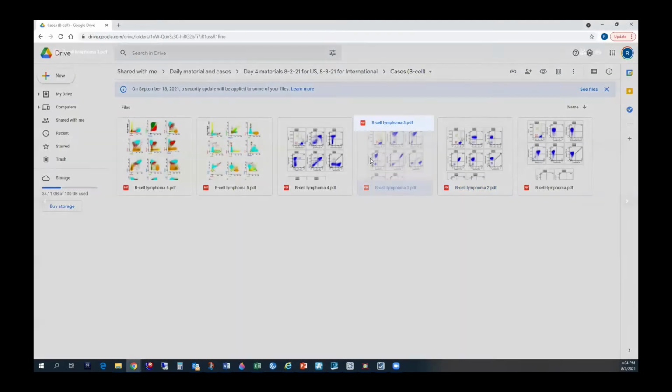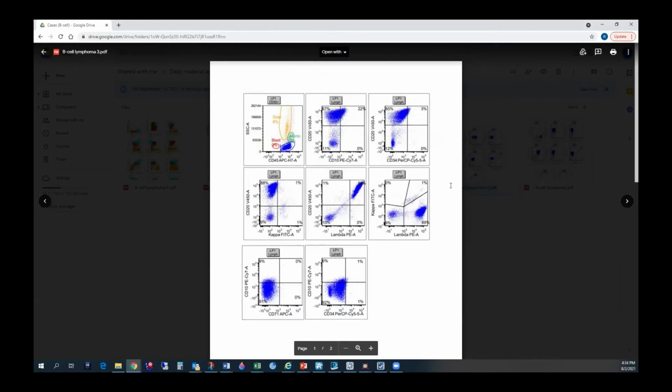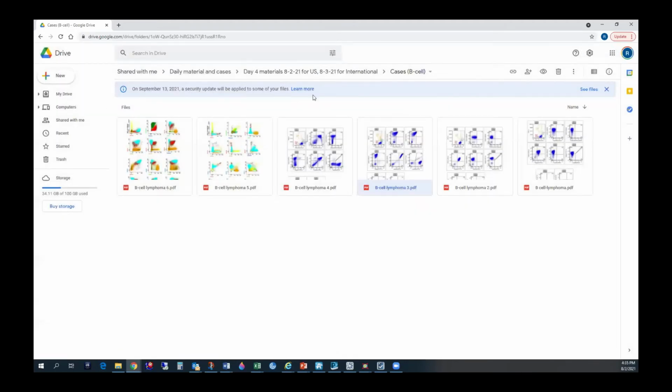Okay, then we'll move to the next one. I just had one question. When we do not have much specimen or the viability is low and we cannot put it into different tubes to run at a time, sometimes they call us and ask, we have limited sample, what would you do? Is what you just showed on case 2 part of the limited B cell panel, or does the limited B cell panel have fewer antigens to work with? Oh no, I just took the pages of the B cell panel because that is relevant for our discussion.